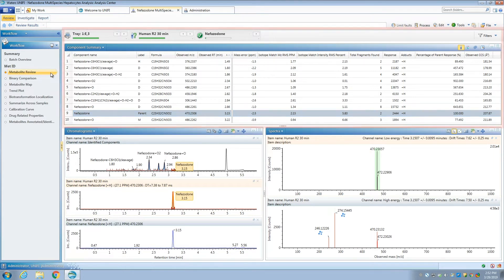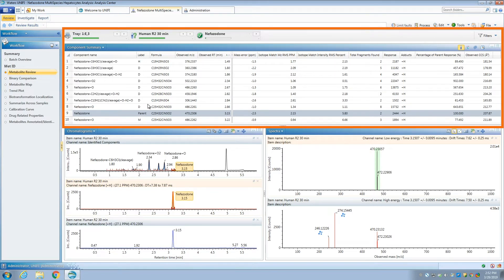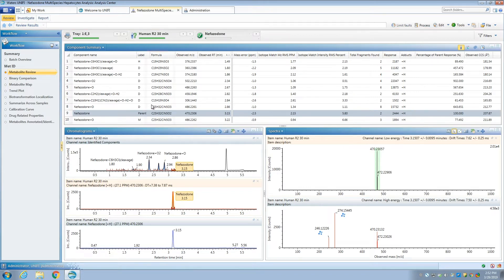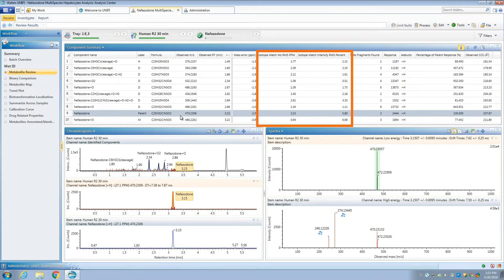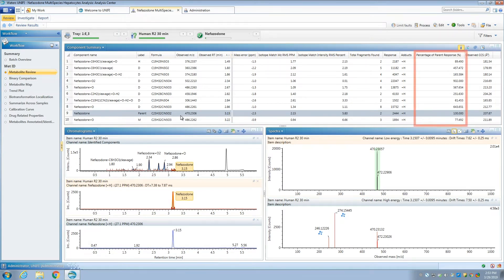The top panel shows the currently selected sample and the metabolites identified in the sample. We can review critical information summarized about the metabolite, including formula prediction, isotopic comparison with theoretical values, mass accuracy, CCS values, and relative response.